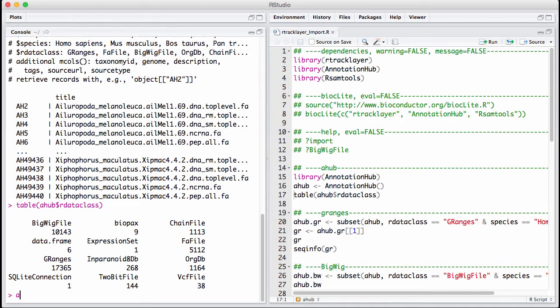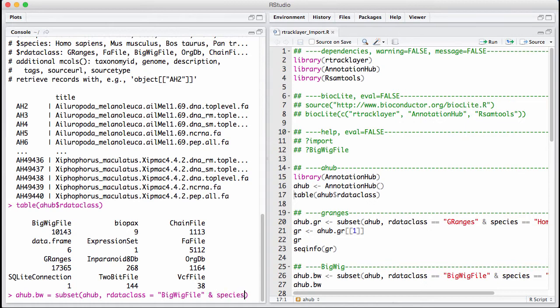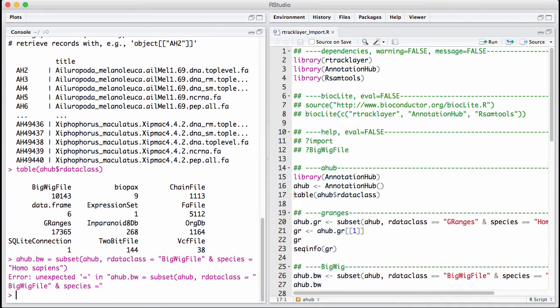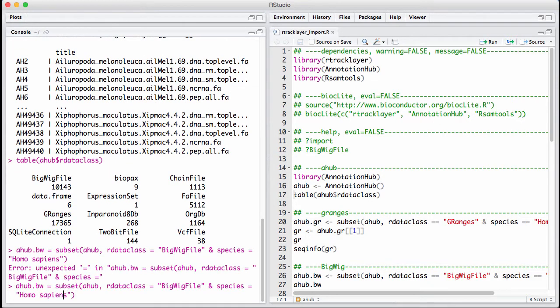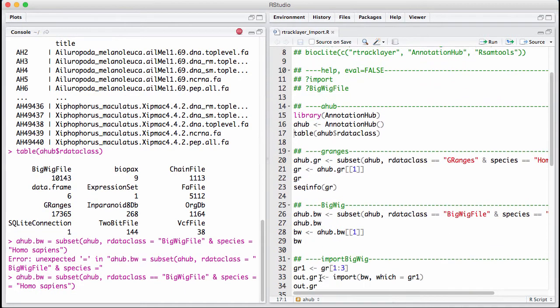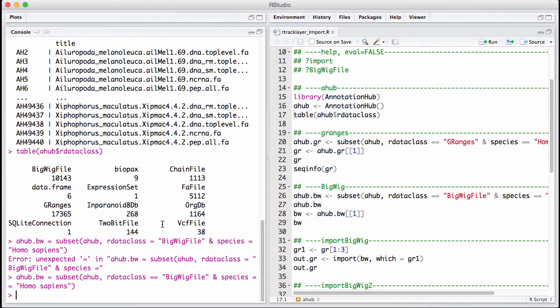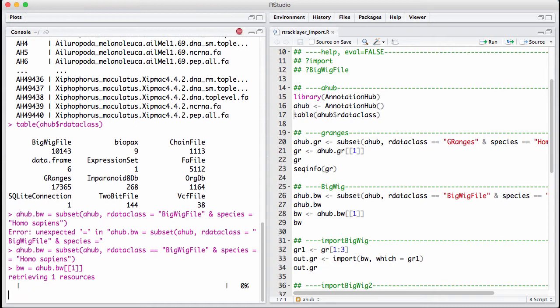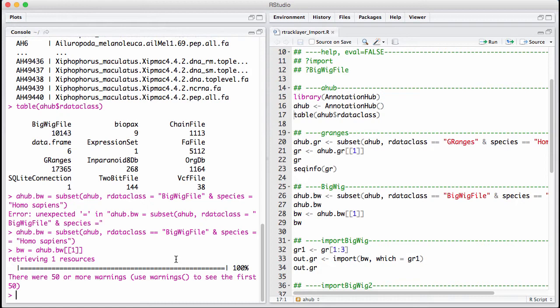Let's take a BigWig file. We're going to subset our AnnotationHub. DataClass should be a BigWig file and the species should be Homo sapiens. We need a double equals. And I'm just going to get the first data set in this list of BigWig files. I don't really care too much about what it is.